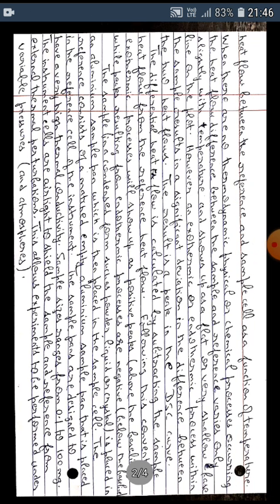This is done at a constant temperature, but it is more commonly done by changing the temperature at a constant rate, a mode of operation which is called temperature scanning. During the determination, the instrument detects differences in the heat flow between the sample and reference. This information is sent to an output device, resulting in a plot of the differential heat flow between the reference and sample cell as a function of temperature.